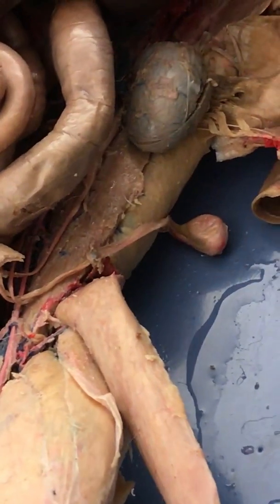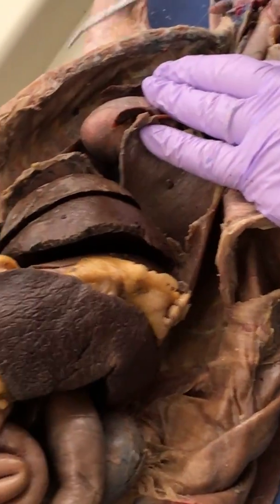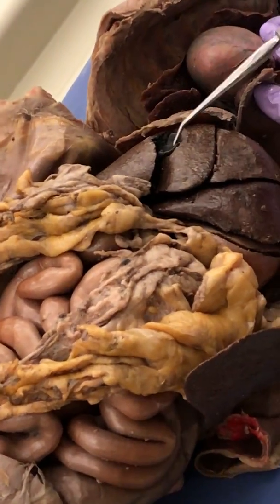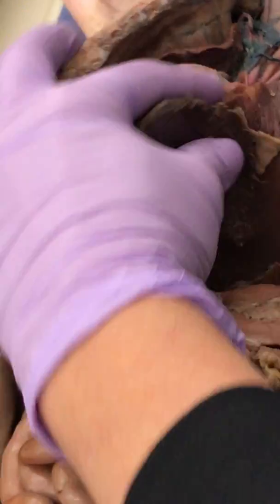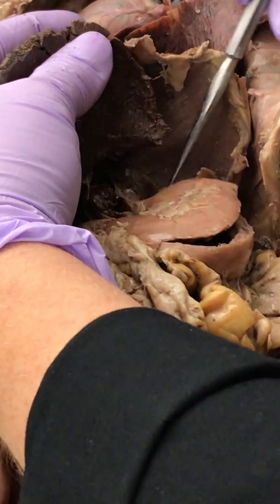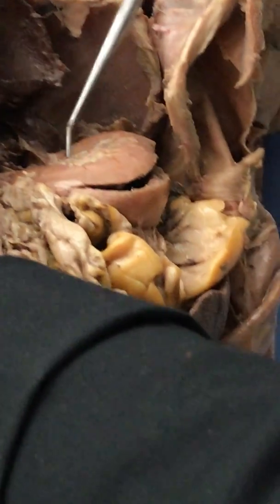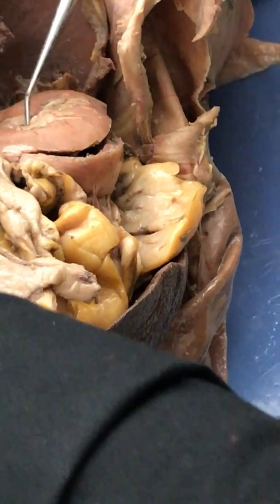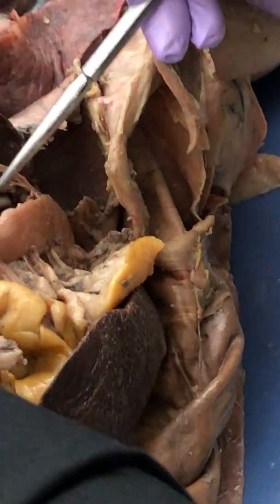You guys know what a lung is? Right. Diaphragm. So the liver. Don't miss the easy stuff, right? What's that? Gallbladder. What's this? Greater omentum. Okay. This is the top part of the stomach right here. Fundus. What's that? That is the lesser omentum. And the lesser curvature. Okay, what's this? Greater curvature. Okay, what are these? Rugae. Okay.